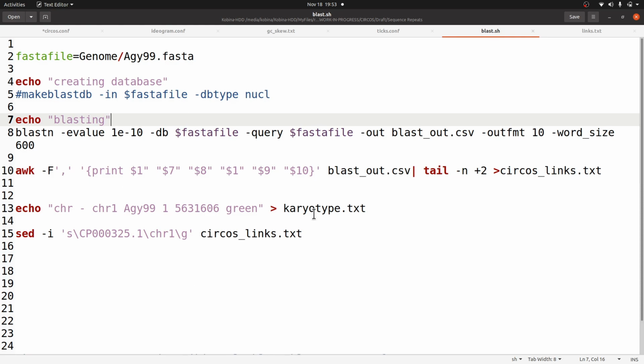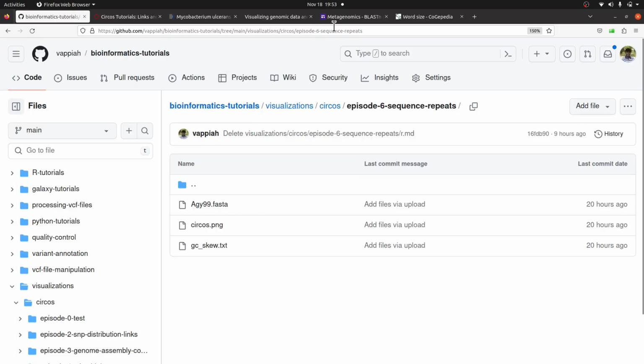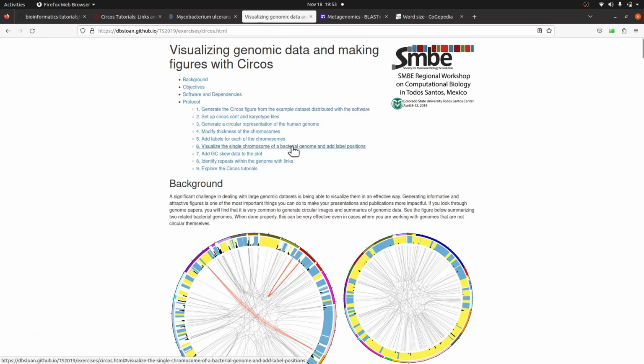But we are still going to go through them anyway because I need to explain how each of these commands works so that you can apply the knowledge to your respective data sets. So let's proceed. I'll start here. This video is based on this tutorial here. I think I have to show that.